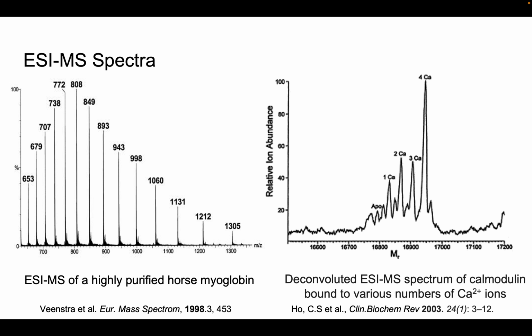So here's a type of spectrum you can expect if you use ESI for your ionization method. On the left, you can see many peaks that correspond to different charges given to the molecule. ESI can assign charges ranging from +1 all the way up to +40. So John Fenn, the person who won the Nobel Prize, realized he could treat each peak as a measurement on its own and found a way to deconvolute the spectrum to give a precise mass measurement.